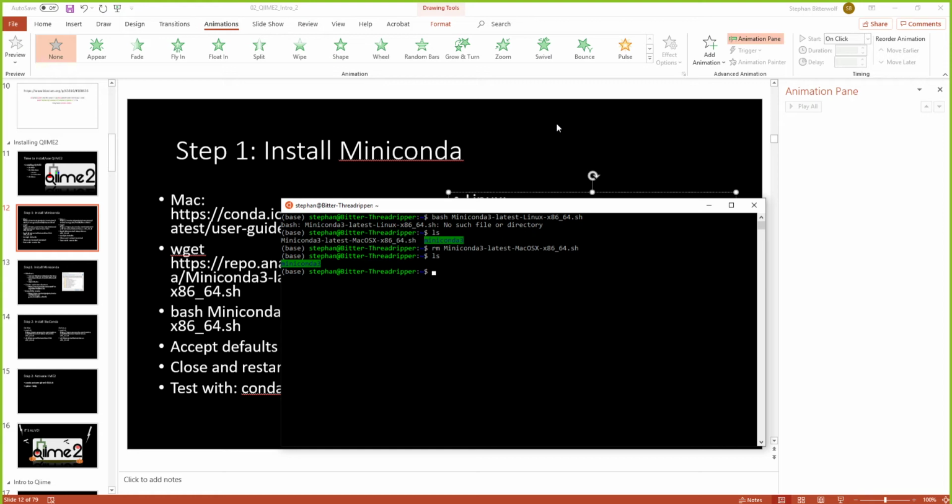So for the Mac people, especially the undergrads, Johanna, Lauren, were you able to install? Are you still in Miniconda installation? Yeah, I'm definitely having some trouble trying to install it because it keeps popping up a screen of code, I think. And I was trying to do the Homebrew, but I don't have it on my computer and it's not letting me. Okay, let's just use curl then.